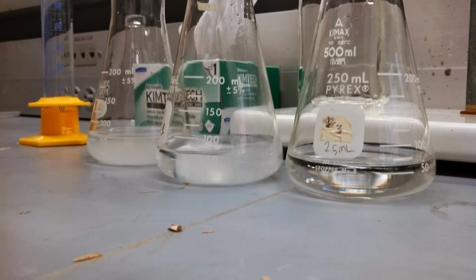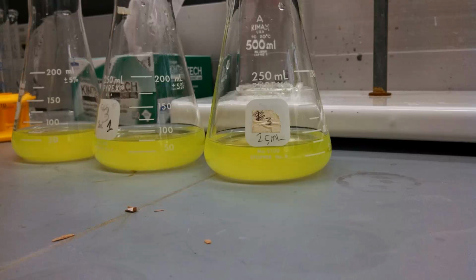You're then going to add 10 milliliters of dextrin. The exact volume is not important, so you can do this step with a graduated cylinder. Once you've added the dextrin to your titration flasks, you'll add the dichlorofluorescein indicator, and it'll turn this green-yellow color.